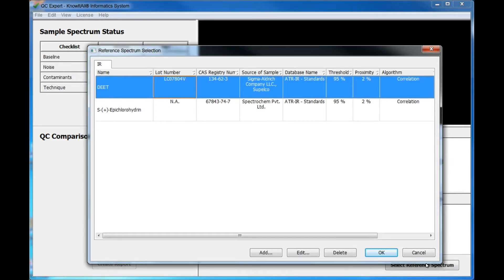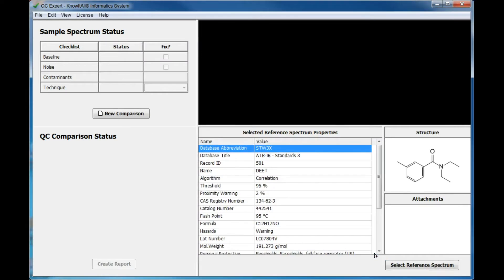Each method specifies the gold standard reference spectrum against which the user will compare a sample spectrum, the algorithm to be used for the comparison, and the threshold and proximity warning settings that define how closely the spectrum must match and how far away other similar spectra must be. Once the reference spectrum has been selected, click New Comparison to begin.